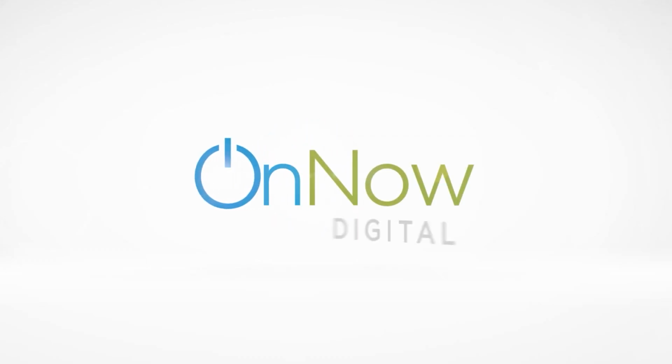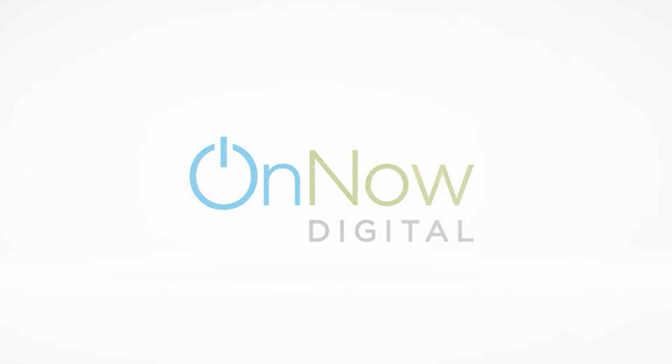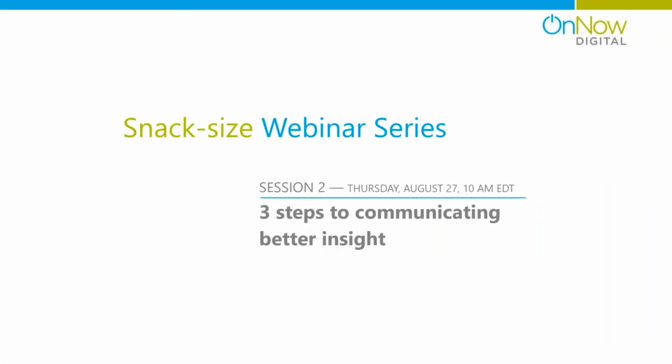Today, we are going to be talking about the analytics side of your laboratory data. So in session 1, we covered how to properly gather information, both from the field and from the instruments and equipment itself, and how to properly store that information for consumption. Now we're going to talk about the second step of the process, which is really the analysis step. So what are the best ways to look at this information? What are some common techniques that they use so that you can have better insight for your customers, and also for yourself and your own business operation?